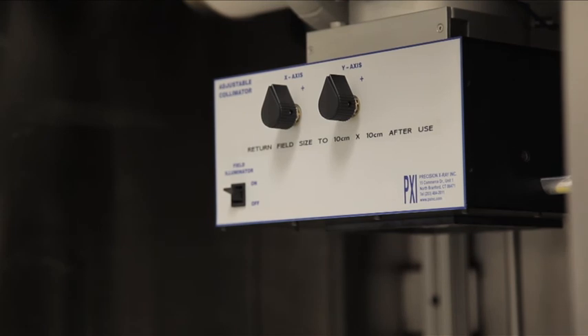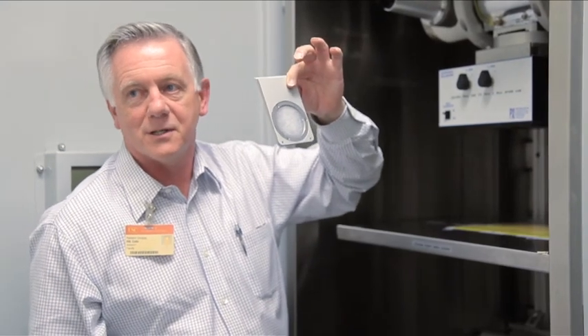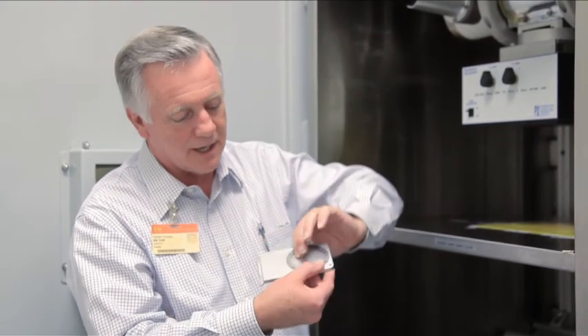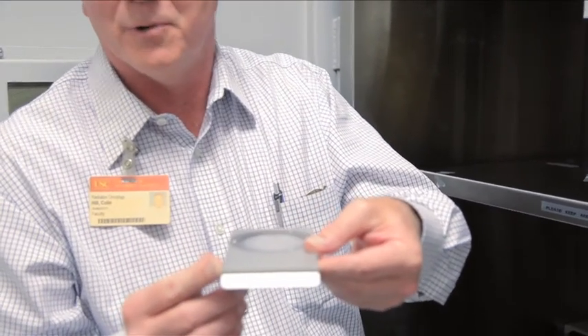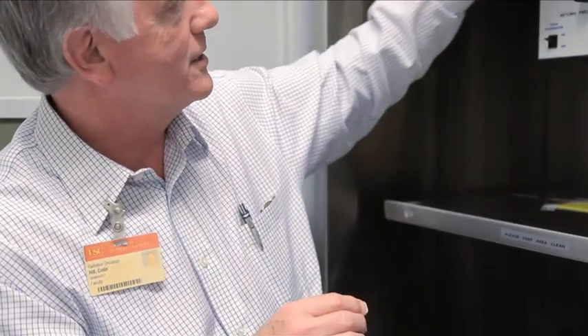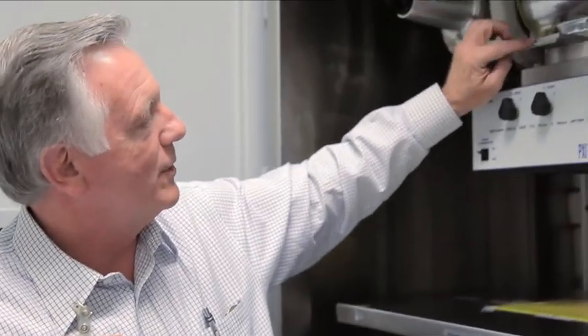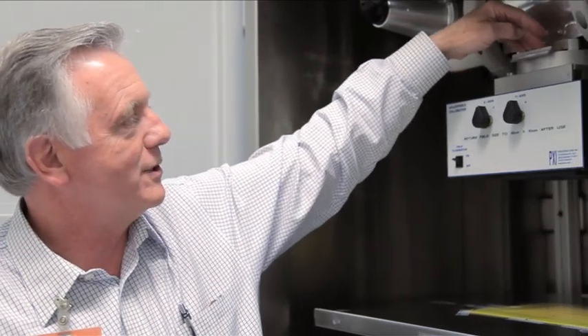Inside there are three important aspects. First is the filter. Most people are using 250 kVp X-rays and they will be using filter F1, which is actually two millimeters of aluminum. That filter goes in this slot. When you push it in, the last quarter of an inch it snaps. It's important that you push it all the way in. If you don't, part of the filter holder is actually blocking the exposure.